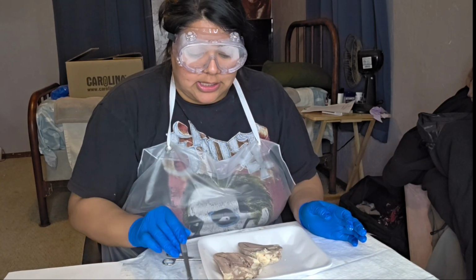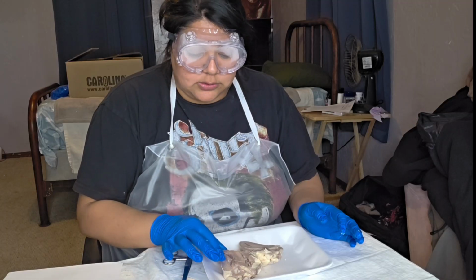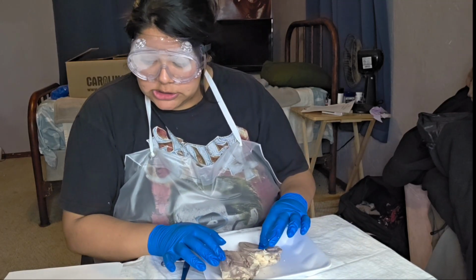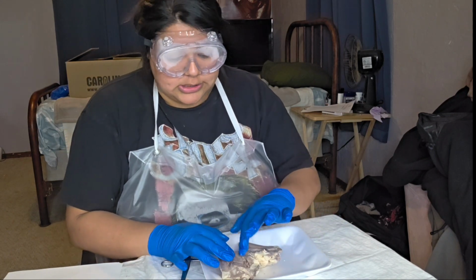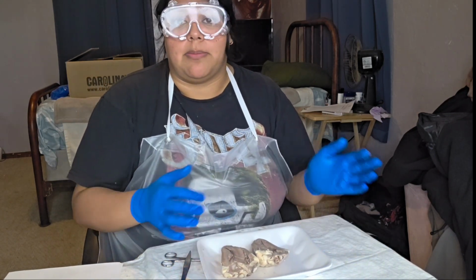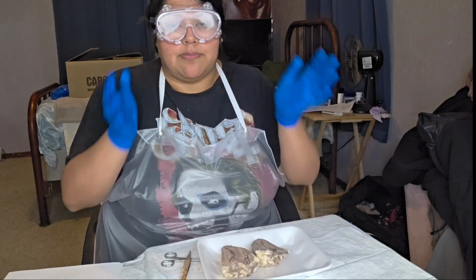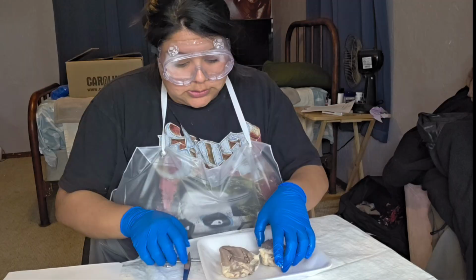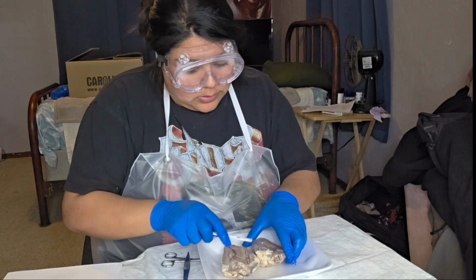Now we can see that the left ventricle has a much thicker ventricular wall as opposed to the right side, because our left side is responsible for pumping blood through the entirety of our body. Cut across the ventricle towards the aorta and cut to expose the valve.